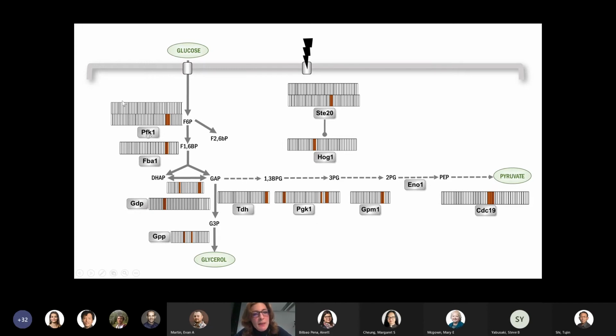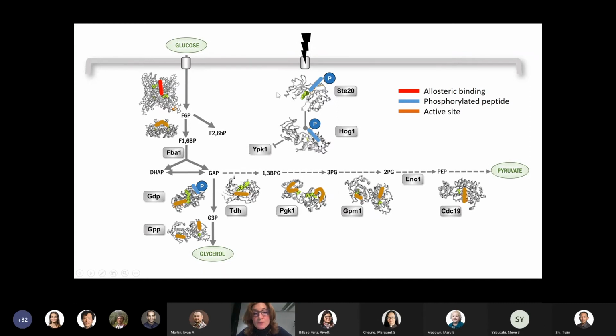So basically peptides mapping to the sequence of each protein and along the sequence of the protein. And in orange, you see the regions that undergo a structural change. And I say it was a surprise because we realized that the changes were extremely localized to only 1 or a couple of spots in a protein sequence. But then we understood what was going on when we mapped this data to available structures of these proteins.